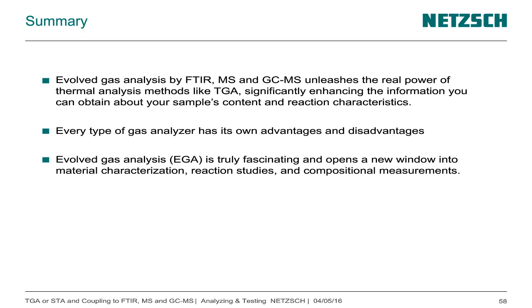It looks to me that if you're combining TGA with GCMS, then to line up the gas evolution in time with a GC oven run, you will already know what your TGA will look like first. Do you have to characterize that a few times before coupling? Do you understand that question? I hope I have understood it.